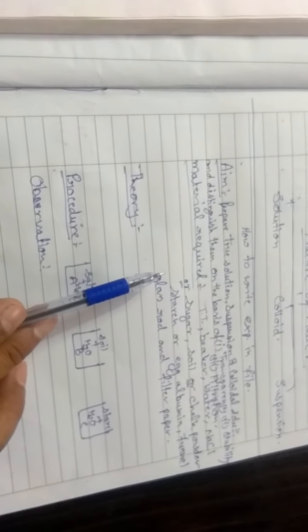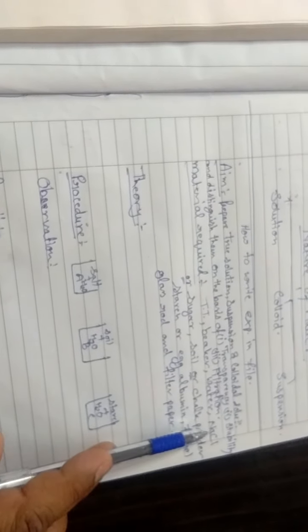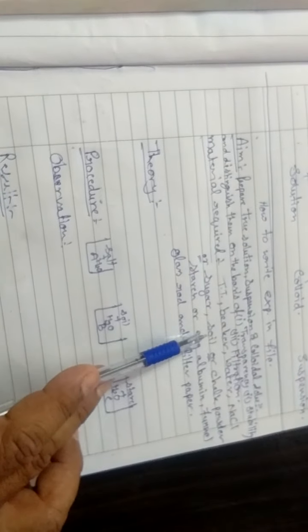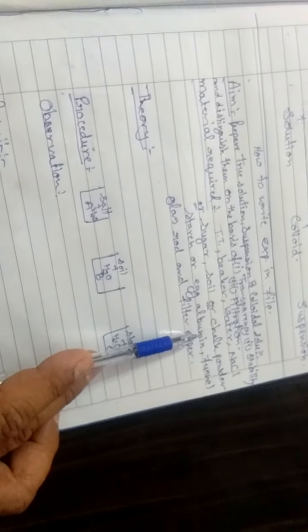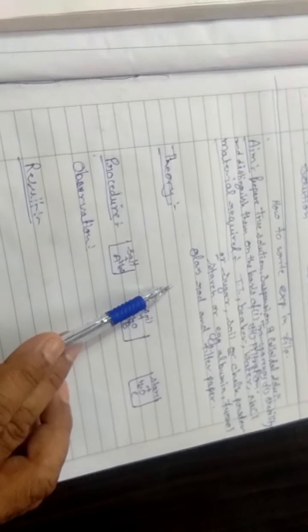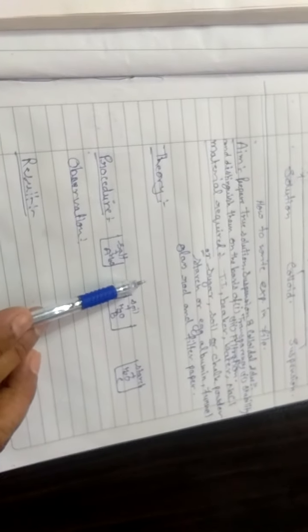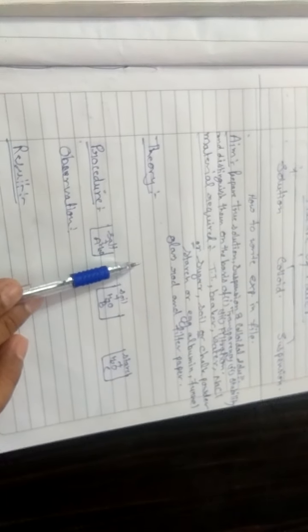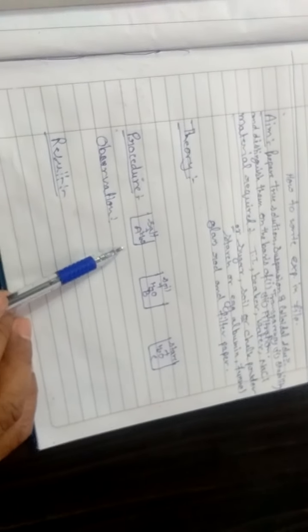The materials which are required are test tube, beaker, water, common salt or sugar, soil or chalk powder, starch or egg albumin, funnel, glass rod and filter paper. Now the theory which we have already discussed in our first video, the same theory, the conceptual background, we will observe in our observation. Procedure. A very simple procedure is there.